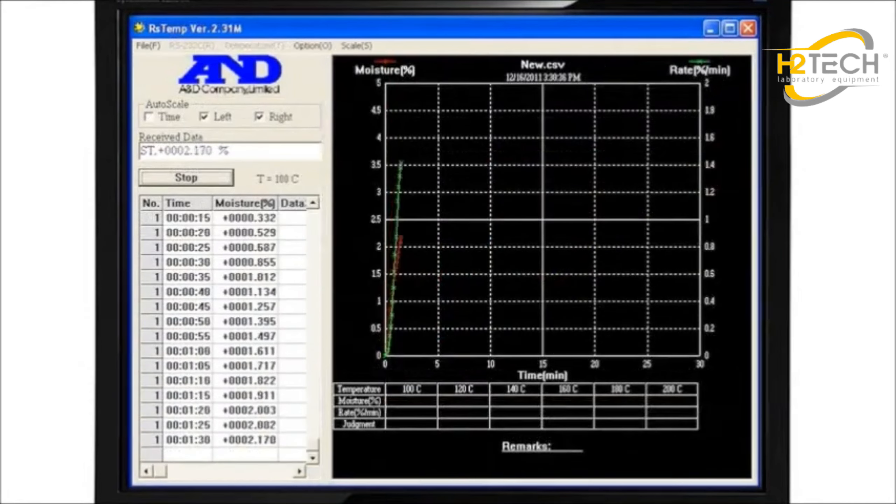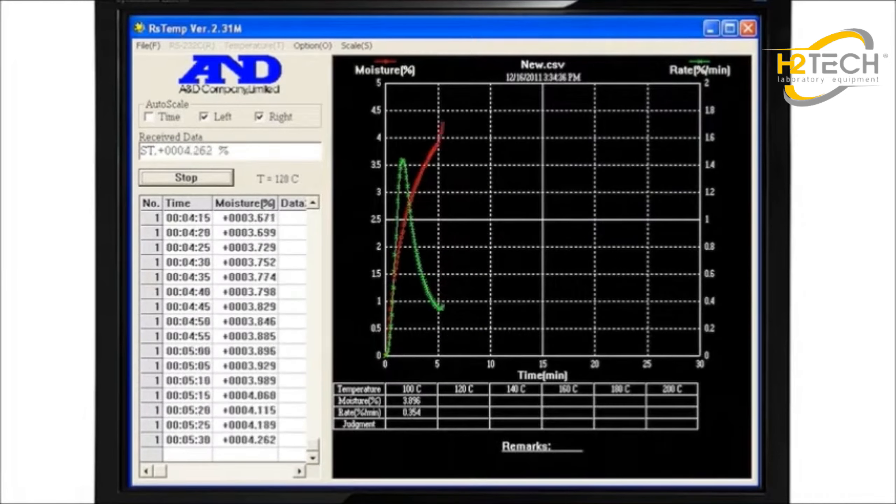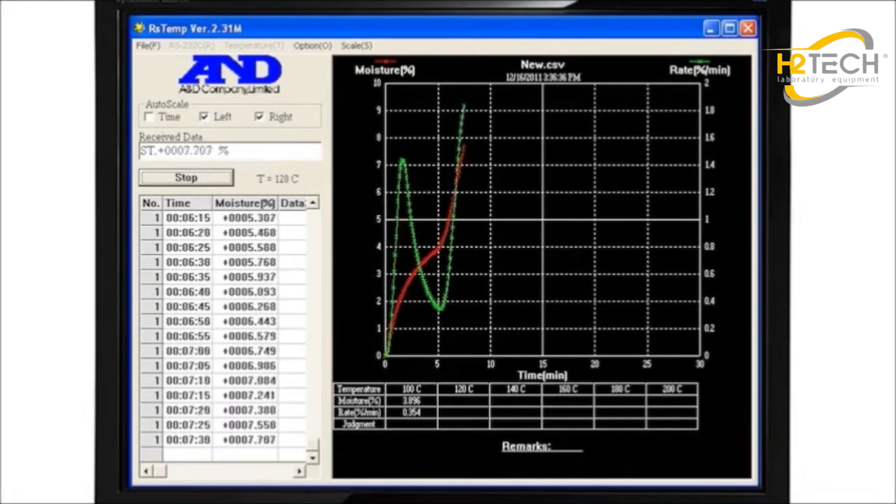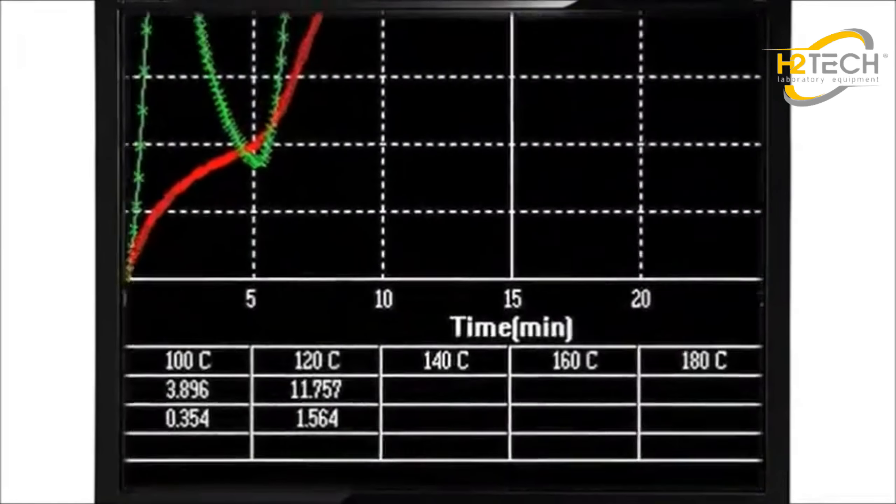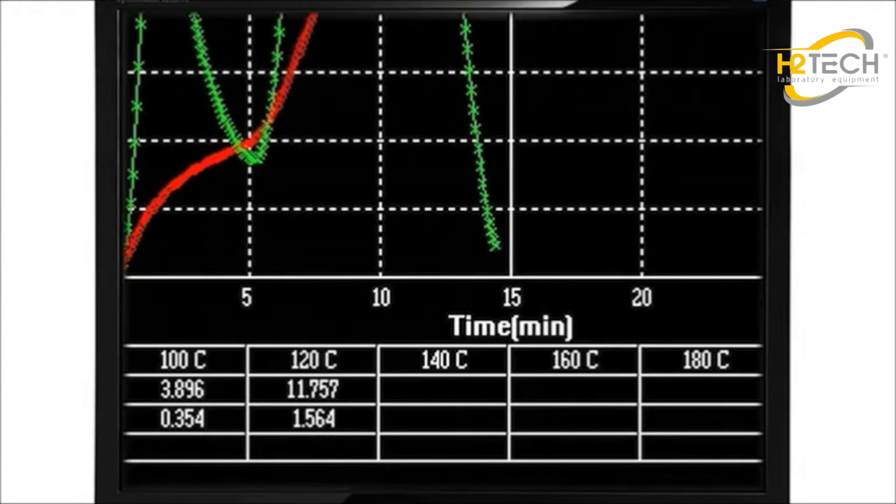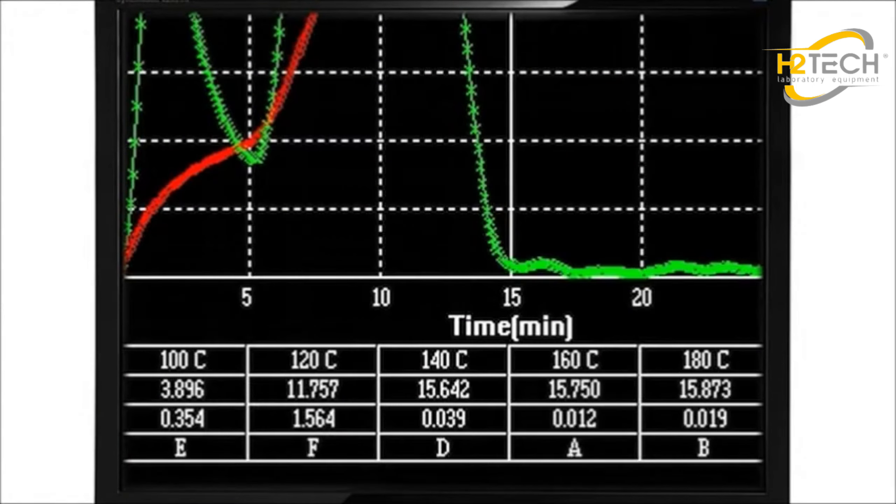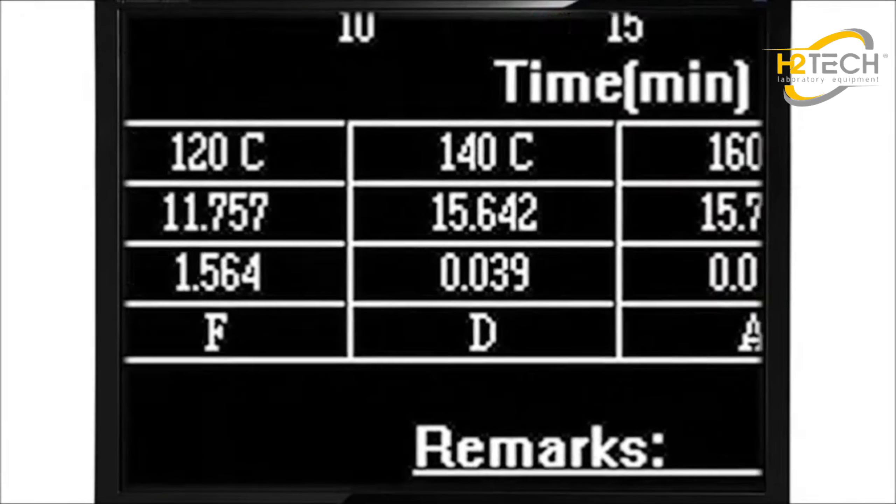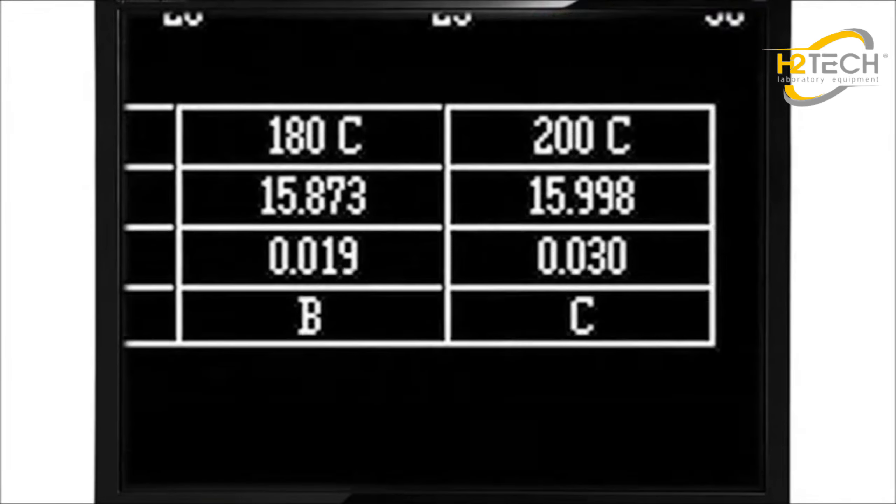Not sure at what temperature to process your sample? The RS-Temp function of WinCT automatically determines the most suitable conditions by changing the applied heat over any range from 30 to 200 degrees C. It outputs a letter grade indicating the optimum test temperature. You can then make this the basis for future tests of the same material.